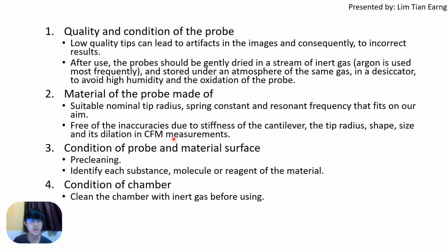So you need to know that actually the tips may have impurities such as dust or other substances that stick on the probe from the previous experiment. So an unclean probe can literally lead to contamination of the materials. So actually pre-cleaning is an important step to make the probe be in good condition, and it should be carried out in a high vacuum chamber.